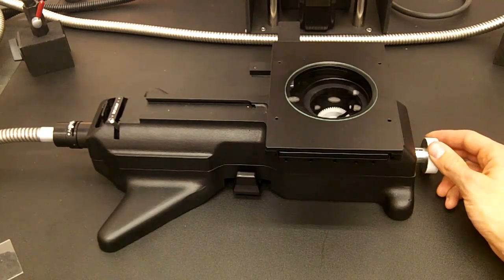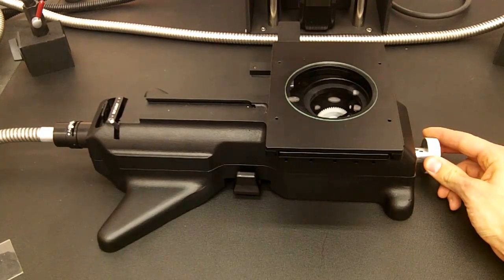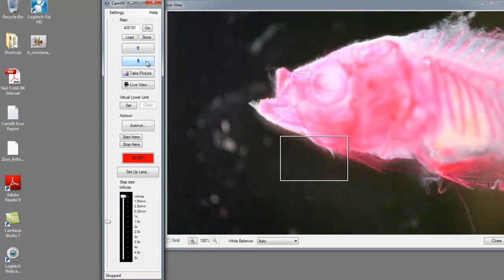Now turning this knob adjusts the position of the backlight behind the specimen. This can be used to create interesting effects depending on the type of picture that you're looking for.